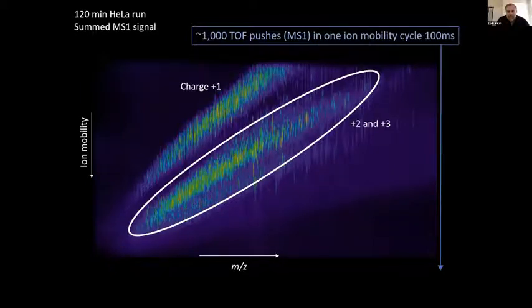Okay, let's see. There are a few questions here of very technical nature. Let me just summarize. A couple of questions relate to your separations, upfront fractionation, and particularly on this run where you get 6,000 proteins in one run. You remind what the conditions were for that.